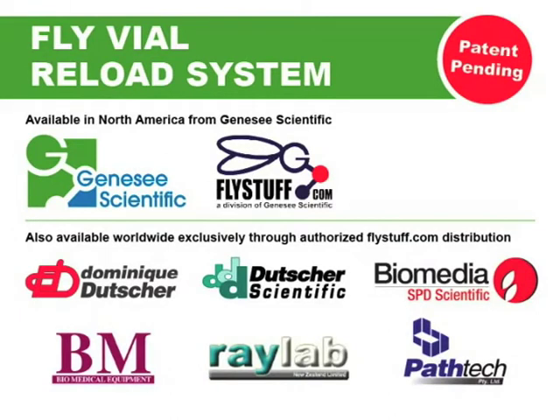Our new patent-pending reload system is available in North America from Genesee Scientific and available worldwide exclusively through authorized flystuff.com distribution partners.